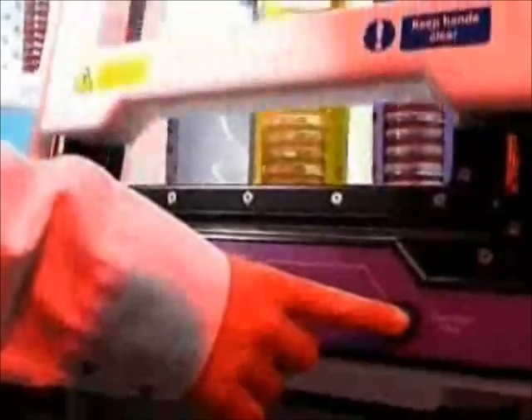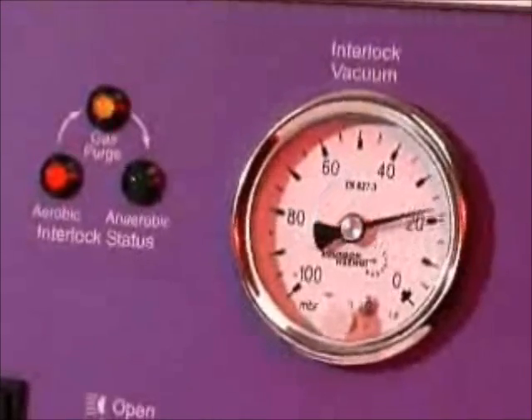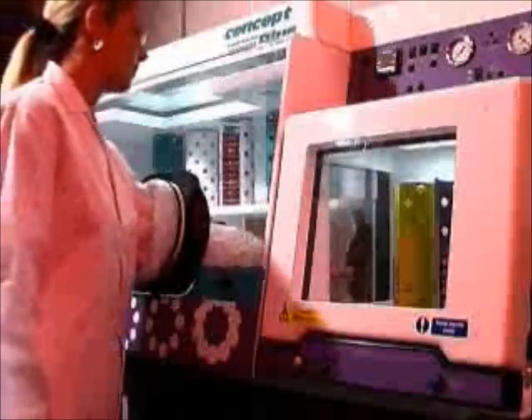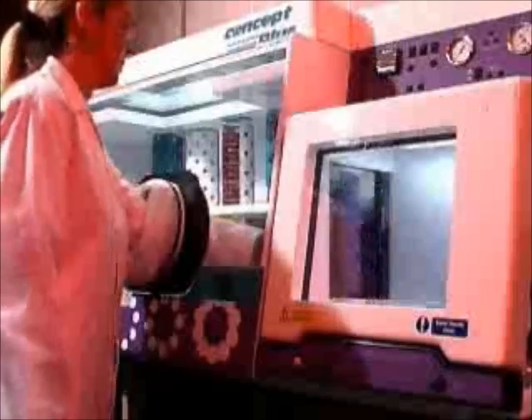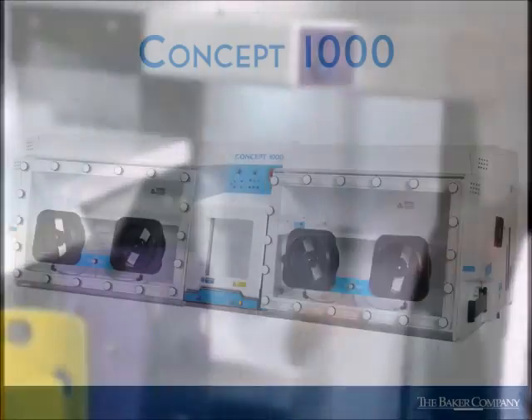The Ruskin Concept Plus Anaerobic Workstation allows the transfer of large bottles, flasks, and small equipment through the generous-sized front-loading interlock. Designed to meet the requirements of larger laboratories, the interlock processes up to 100 plates in just five minutes, but also offers an economy cycle to introduce smaller loads in a fraction of the time. The fully automated interlock features class-leading one-touch operation and easy access for loading and unloading with a convenient pull-out shelf.